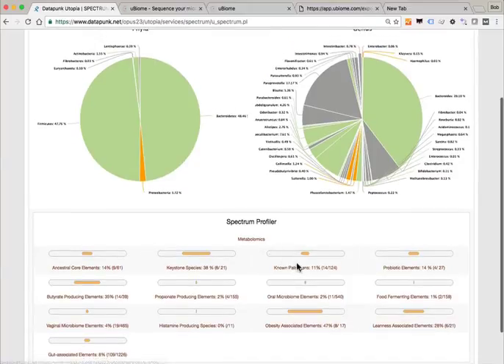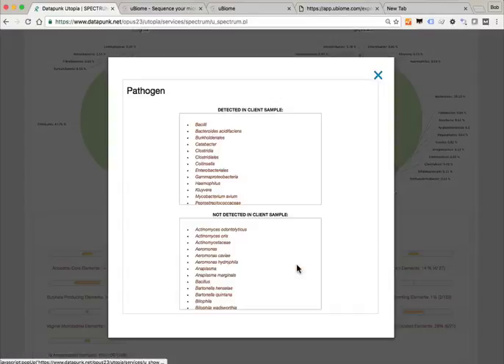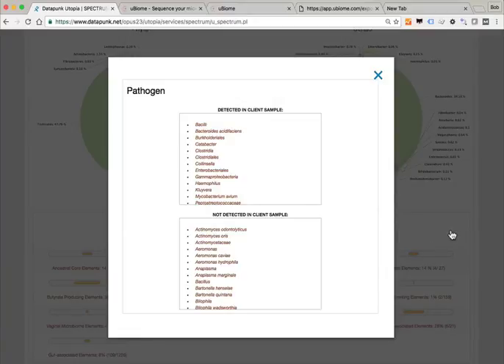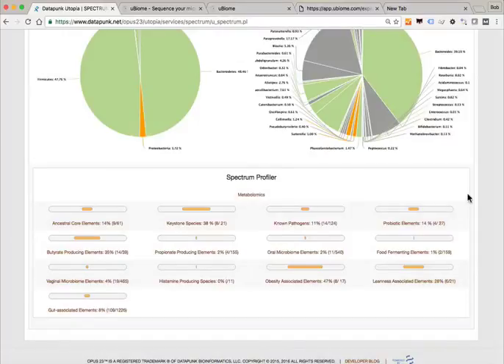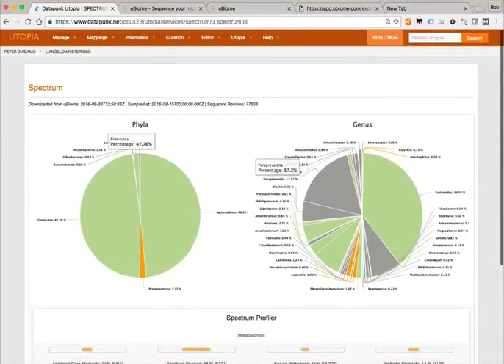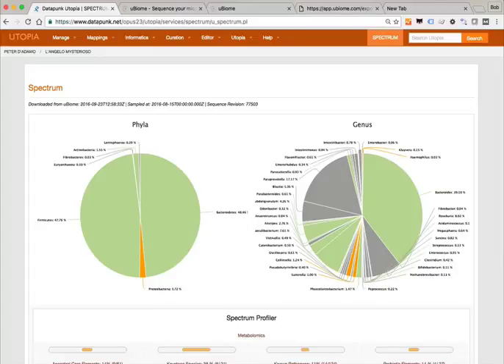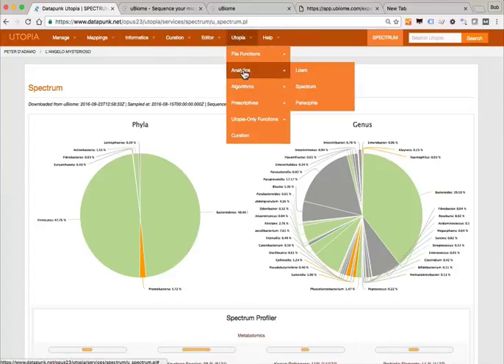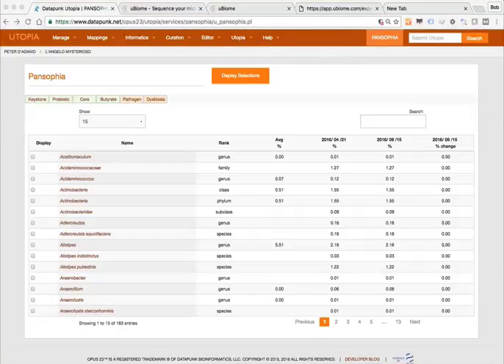You can click and it tells you the ones that are in the client sample and the ones that are not in the client sample. This is a good starting point if you don't know where you're going. The benefit of Spectrum is that it allows you to get a thumbnail sketch — it's kind of almost the equivalent of the Strobe app. The Pansophia app basically gives you the opportunity to look at sequential data.